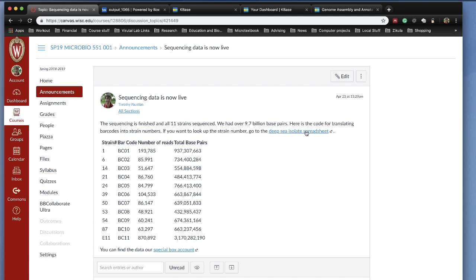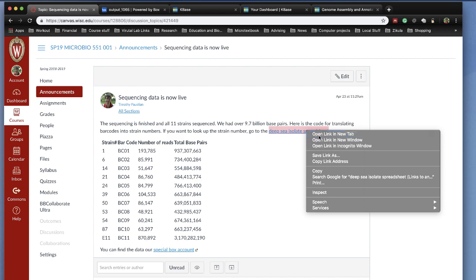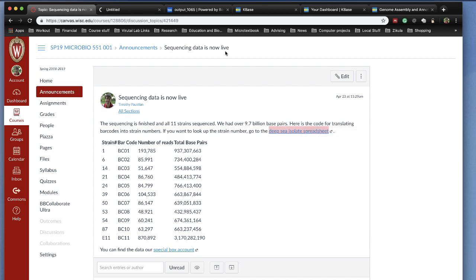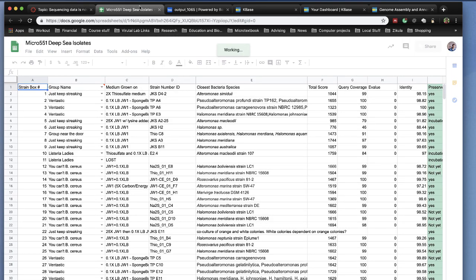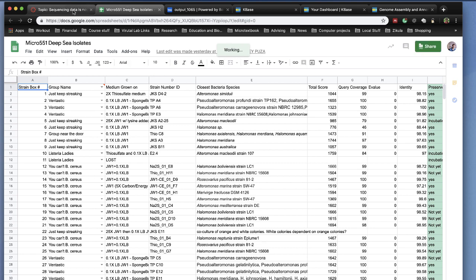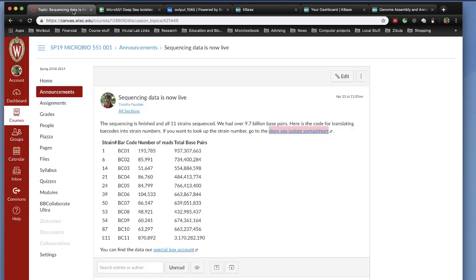If you want to refer back to the Deepsea Isolate spreadsheet, you can click on it right here, and that will take you to the spreadsheet and it will show you the strains that we have then sequenced. If you want to now get the data, here's the code. The barcodes are here, BC01 to BC11. Here's the strain numbers. Pick the strains that you want to work on.